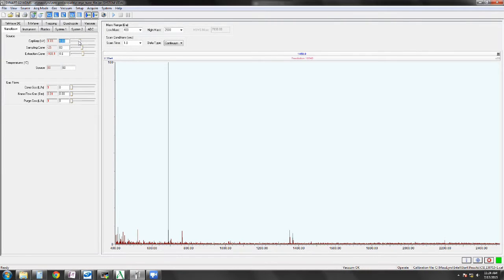First, by going up in voltage. No great change in the signal. And again, by going down in voltage. Some samples prefer higher voltage and some prefer lower voltage. But in general, try to keep the voltage as low as possible. By increasing the cone, we'll probably see the fragmentation of this octamer. So as I go up in cone energy, we'll see a decrease in this intensity, an overall increase in this peak but lowering of the charge spectrum. As we go lower, we'll see the octamer coming in much more strongly. And we'll start to see some hexamer appear here. Again, as we have a non-covalent system and it isn't particularly salty, we want a nice low voltage. And we can also do the same with the extraction cone, although it has a lesser effect.